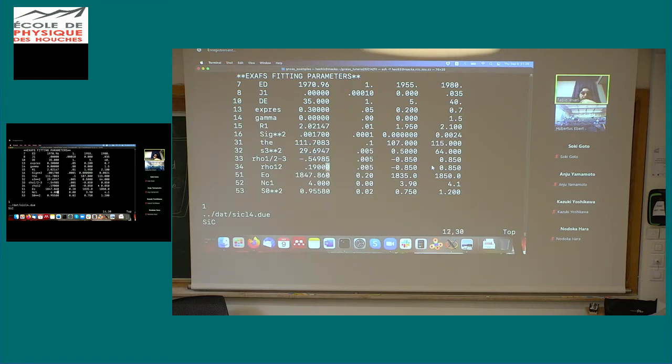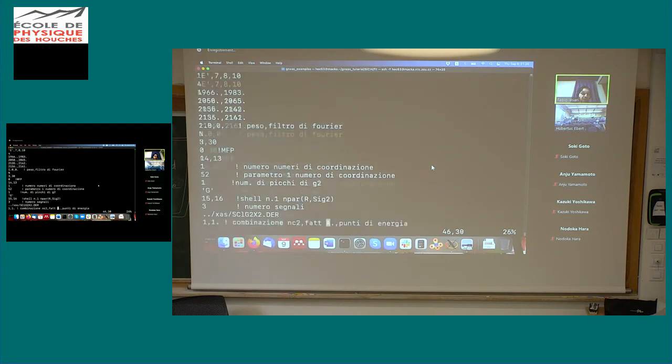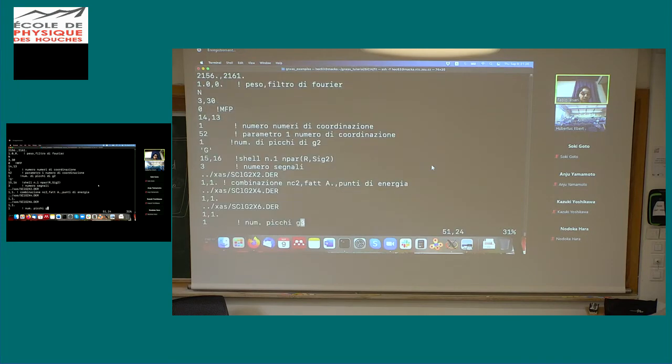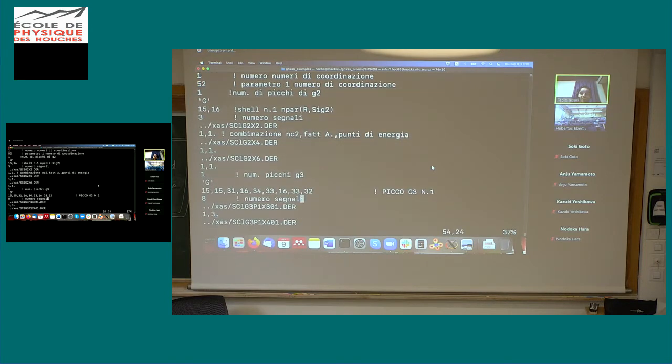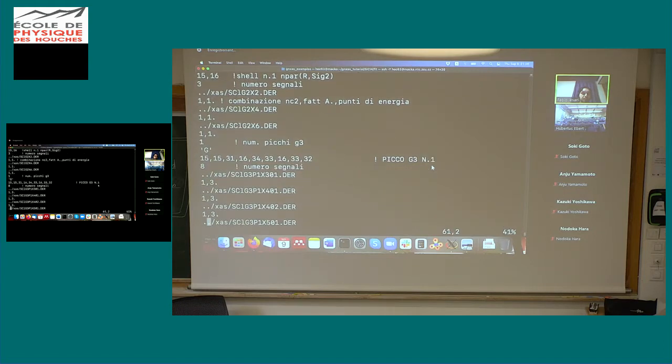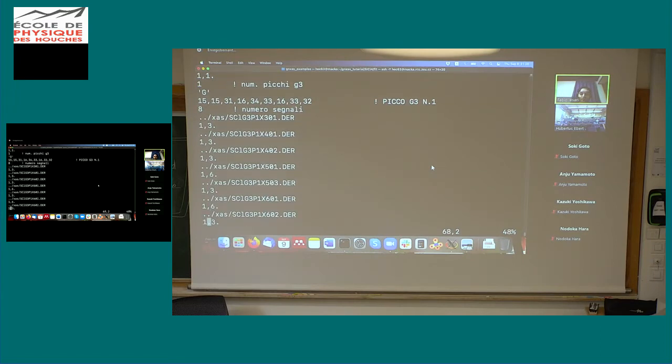Okay. Once we have all this, then again, as before, we can put many different signals, or we can use the total three-body signal. In this case, if we use the single scattering terms, actually it's a bit more complicated.